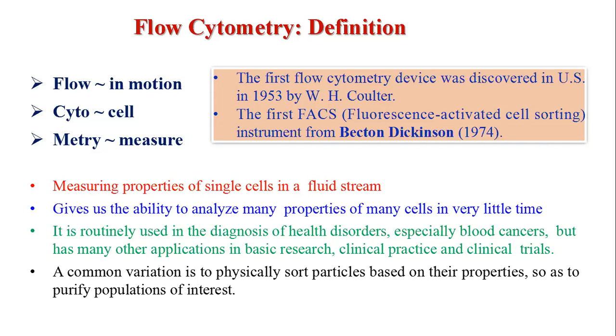So you cannot separate all the types of cells, and you cannot confirm that this is the only type of cell present in my sample. We are getting a picture, maybe an ultrastructural view of cells.